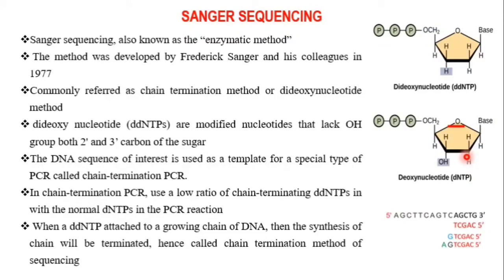And we said that a dideoxynucleotide is a modified nucleotide that lacks a hydroxyl group on both the second carbon and third carbon. You see here, there's a second position and there's a third position. What is the problem with that?